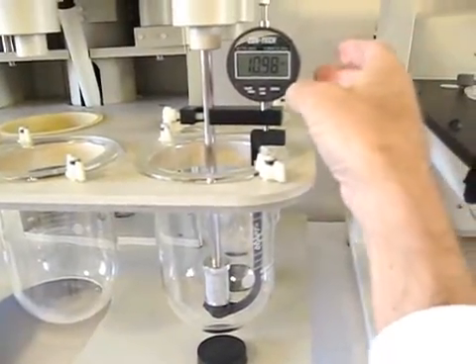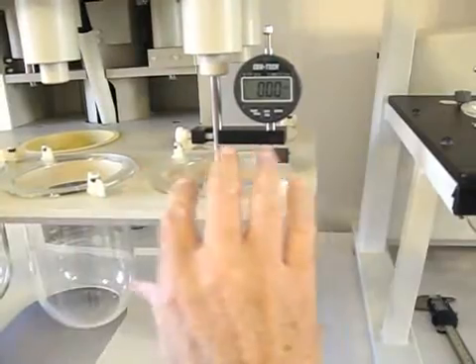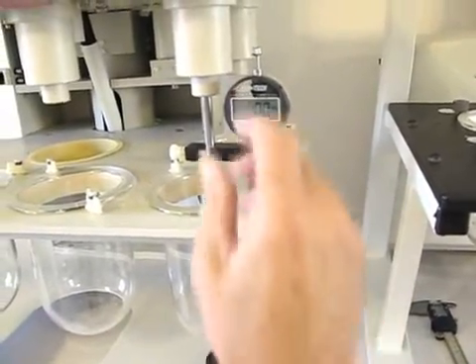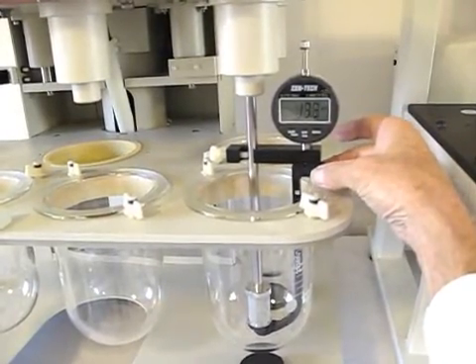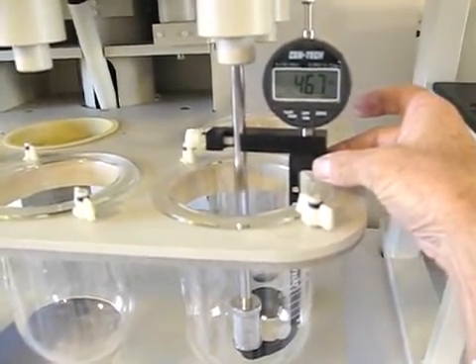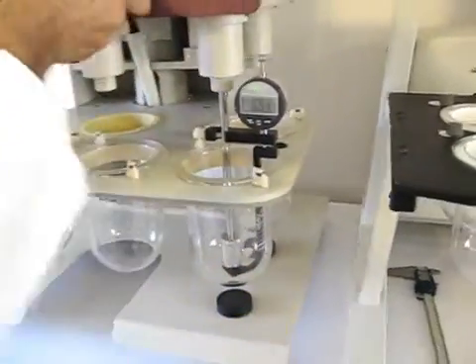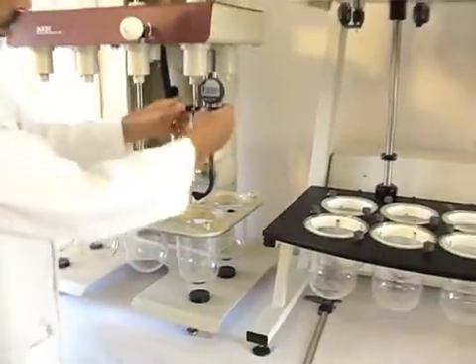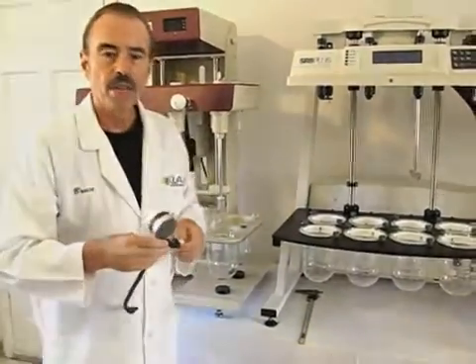Okay, we've got approximately 10, and I will zero the gauge. Now, by the way, when you zero the gauge, try not to touch the top of the base plate or any of the components because you'll influence the reading. And that holds true for all of the other instruments. So we've got zero on the gauge, and we're going to lift. 4.67. So adding 20 to that, I have 24.67 millimeters. And that's what I would record for this vessel position. And then of course I would go around and do the same thing on all vessel positions, and you will have very accurately reported the height of the basket or paddle shaft heights.